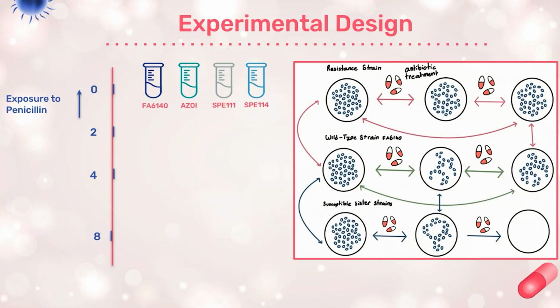So this is the overall schematic we were going for when designing the project. Essentially, we did an analysis between all the strains and all the time points. And the goal is that we're able to find some pattern between all of these comparisons that answers our question, again, which proteins, or which group of proteins, are contributing to resistance.